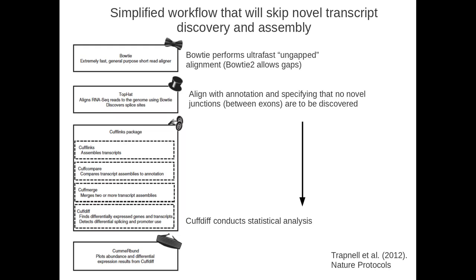So this is just an introduction to the workflow. We'll continue our analysis of this same data set next week. Hopefully this introduction will help you to get through the homework and to answer the homework questions, but we'll be going into more detail on each of these steps, particularly Cuffdiff and the statistics, and we'll be implementing CummeRbund to display the results and take a closer look at individual genes.